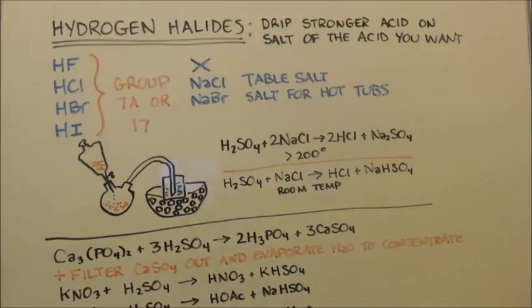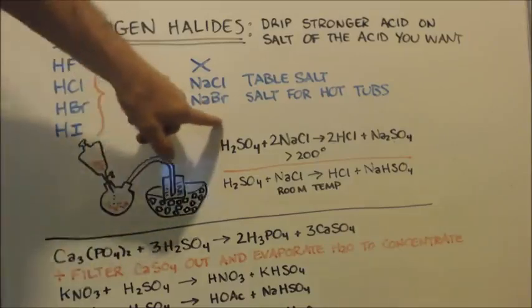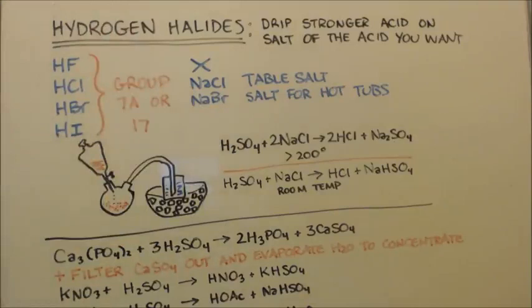Oxidation is good. It's on the right side of the list. That's the best thing in the world. They're great people, so they're oxidized, and he was negative, and sulfuric acid oxidized it up to neutral. You know what I mean? Took his bills away, and now he doesn't owe anything. He doesn't have anything, but he doesn't owe anything like he did before, right? So he's oxidized. So what you would do is drip phosphoric acid onto sodium iodide, and then you can distill out your hydriodic acid. That way, the phosphoric acid won't oxidize the sodium iodide to iodine. It will just make the acid.